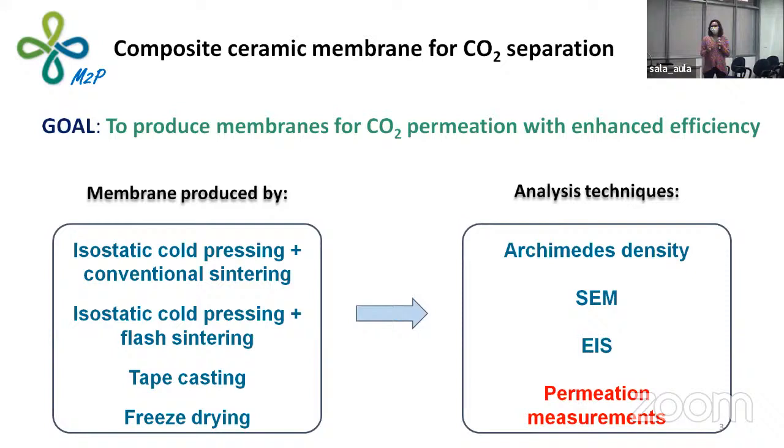We did electrochemical impedance spectroscopy to analyze the conductivity of both phases. And last but not least, the permeation measurements, so we can calculate the efficiency of this composite membrane.